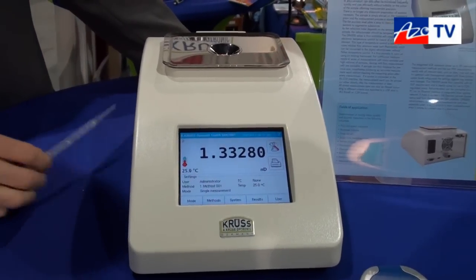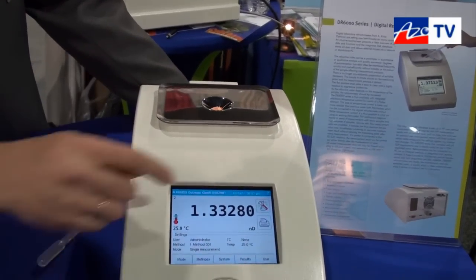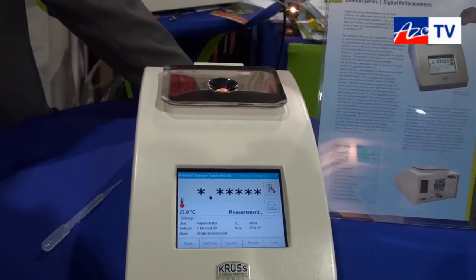Measurement is very easy to use. You need only a sample here — just a drop — push here and the measurement will start automatically.